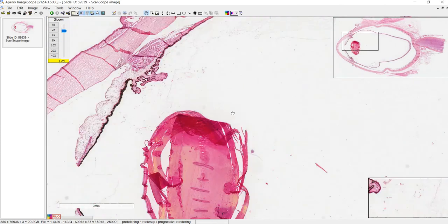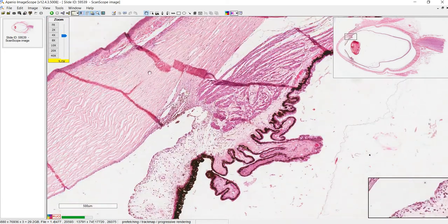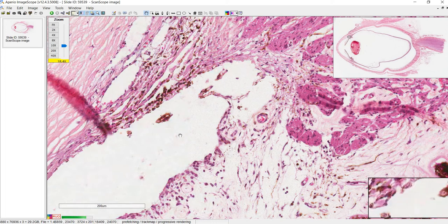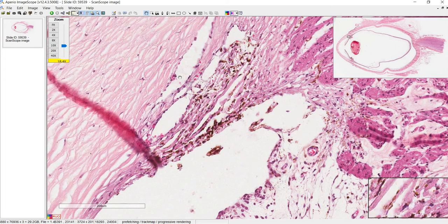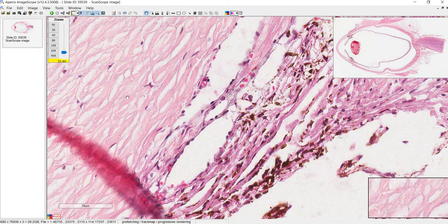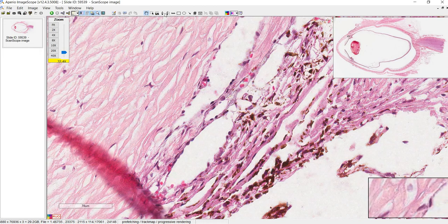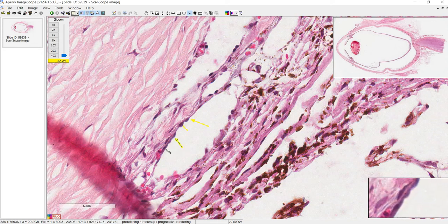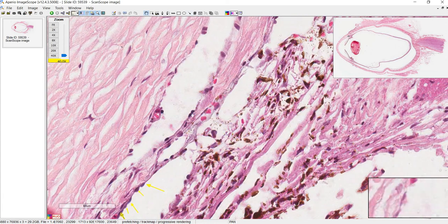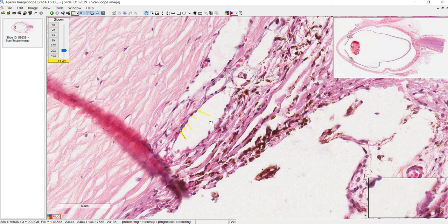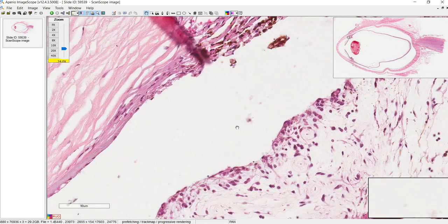Here we have the human eye. Let's zoom in on the iridocorneal angle — here's the iris, the cornea, and the sclera, so the limbus should be around here. This is the angle where the trabecular meshwork should be, and I think the canal of Schlemm is some combination of these structures here. Despite some tearing artifact, if you look closely you can see nuclei lining what appears to be a real lumen — I think that's the canal of Schlemm. It's somewhat analogous to CSF draining into the arachnoid granulations and then into the dural sinuses.